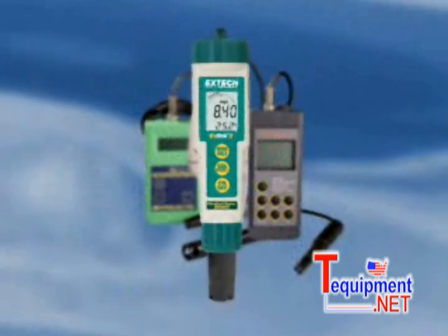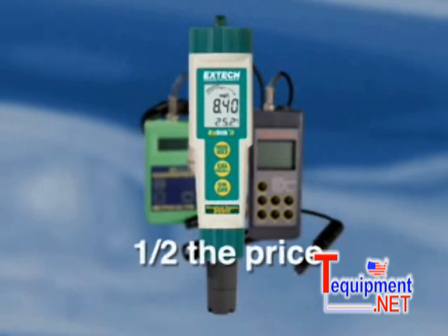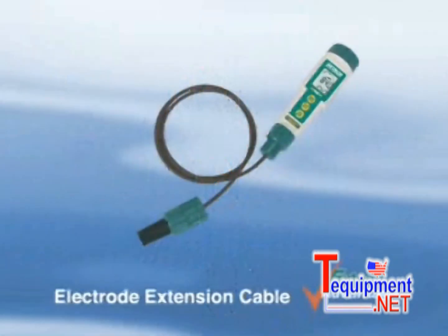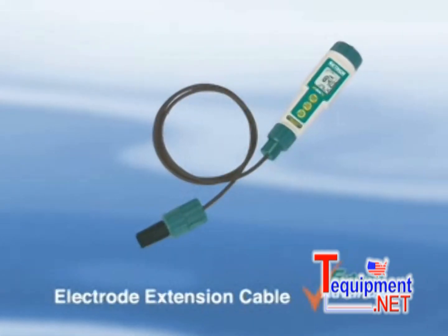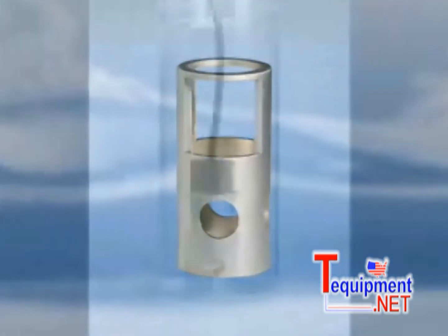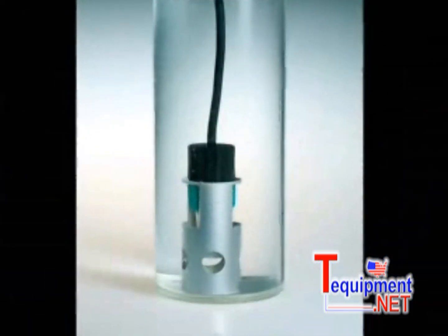So why pay more on a handheld DO meter when you can buy a stick-style dissolved oxygen meter at a fraction of the cost? Optional extension cables of 1 meter or 5 meters allow for measuring in difficult-to-reach areas. A weight keeps the electrode submerged while taking an underwater measurement.